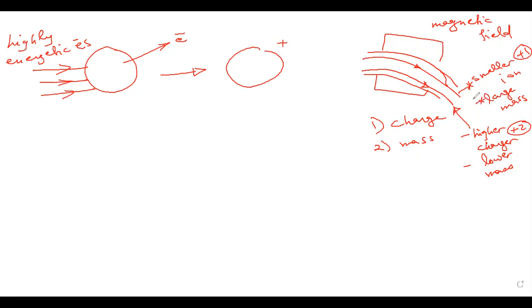And then they will enter the detector, where the mass spectrogram is drawn, and we will get certain peaks or certain lines that we are going to call peaks. Of course, I'm going to explain afterwards what happens here, but I just wanted you to remember what we did before about the mass spectrometer. Okay?